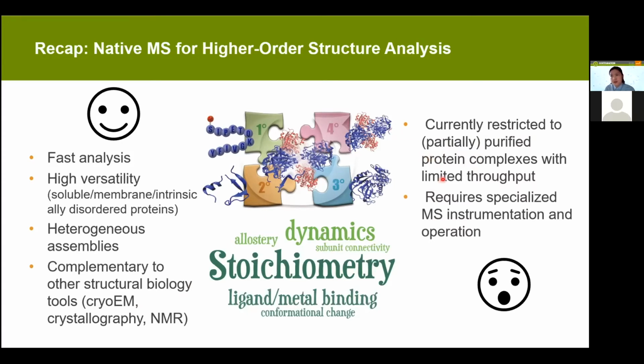But it's still quite challenging to do this at a whole proteome level, which is what people have been doing for bottom-up proteomics. So there is still a lot of development required to have this front-end separation to simplify this, and also to improve the mass spec detection and speed to really study the native proteins at the proteome level.